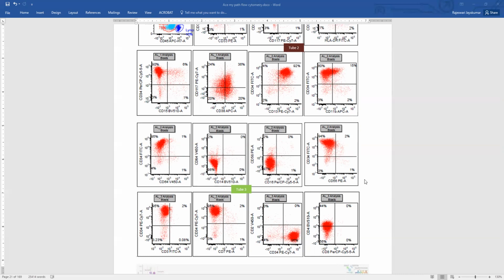One thing to remember is that treatment can change the phenotype. Even when these cases relapse, or if they are resistant to treatment, there may be variation in the phenotype. They don't have to be exactly the same. Also in minimal residual disease, the phenotype can be different. So two things can help with MRD.